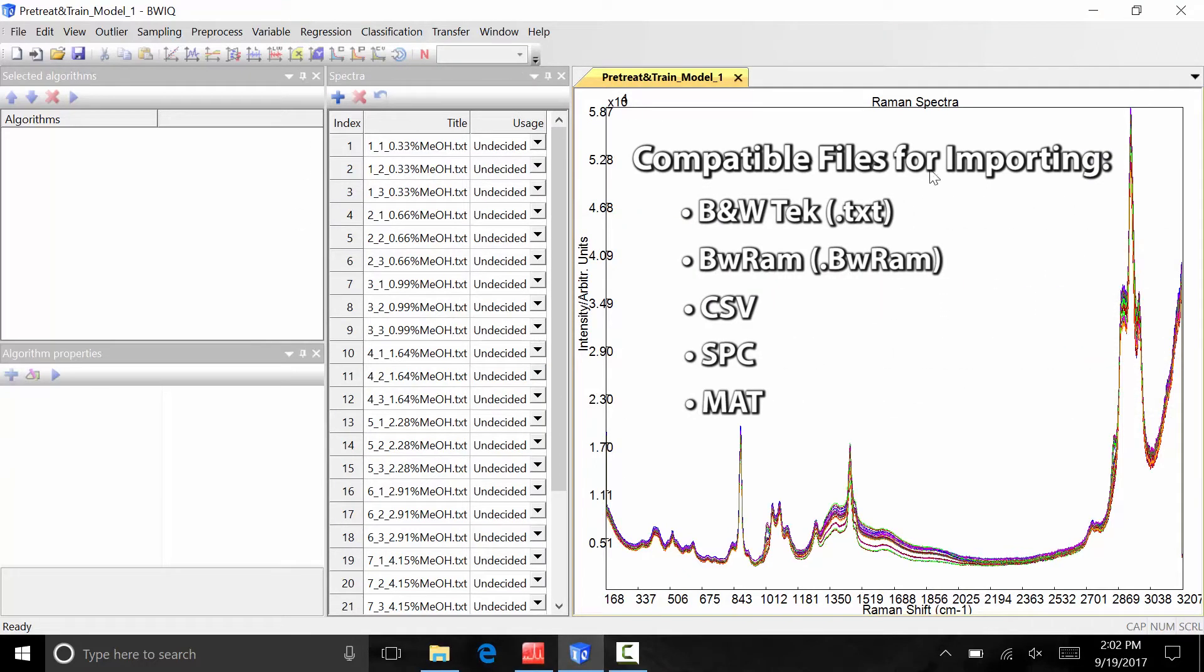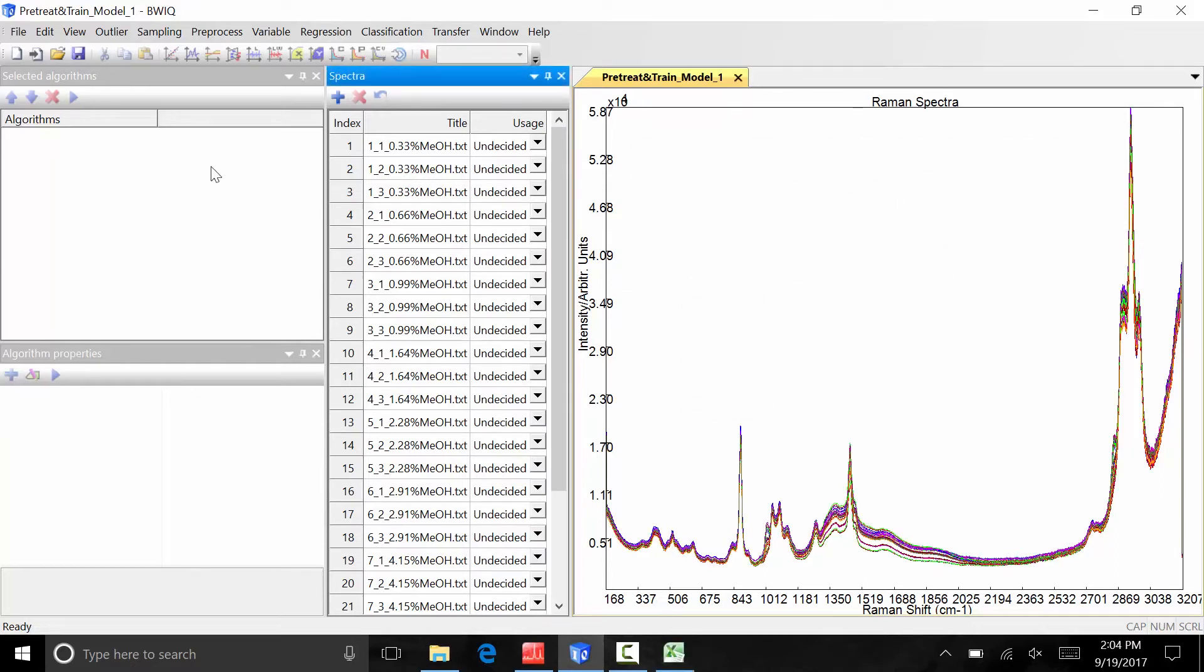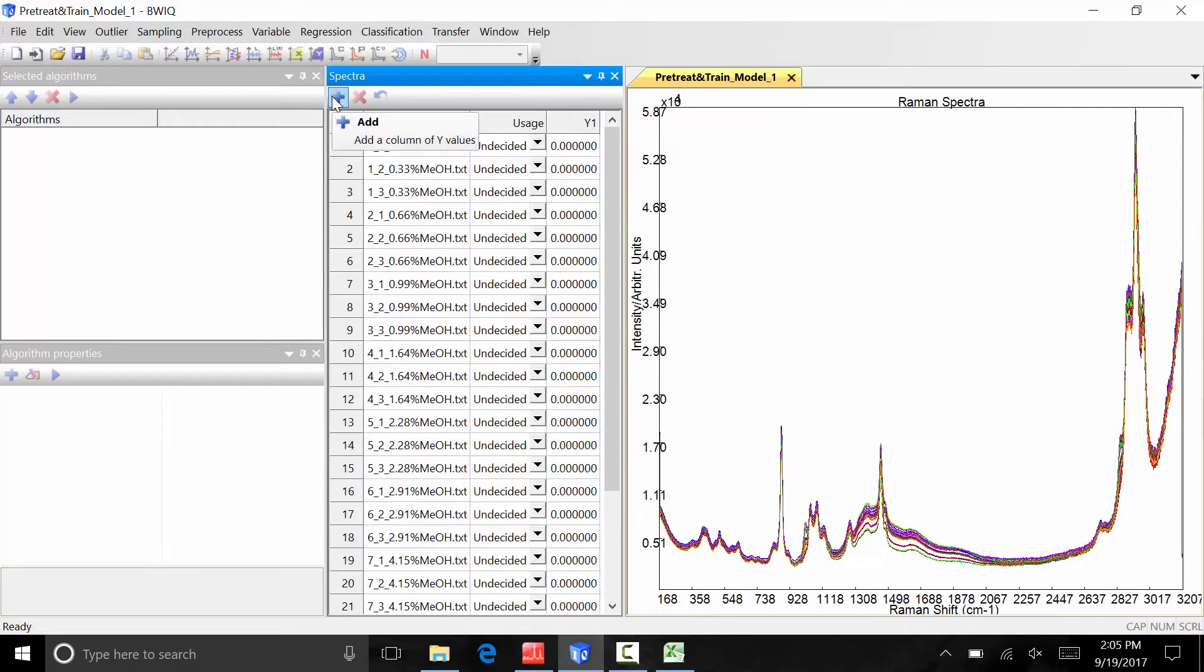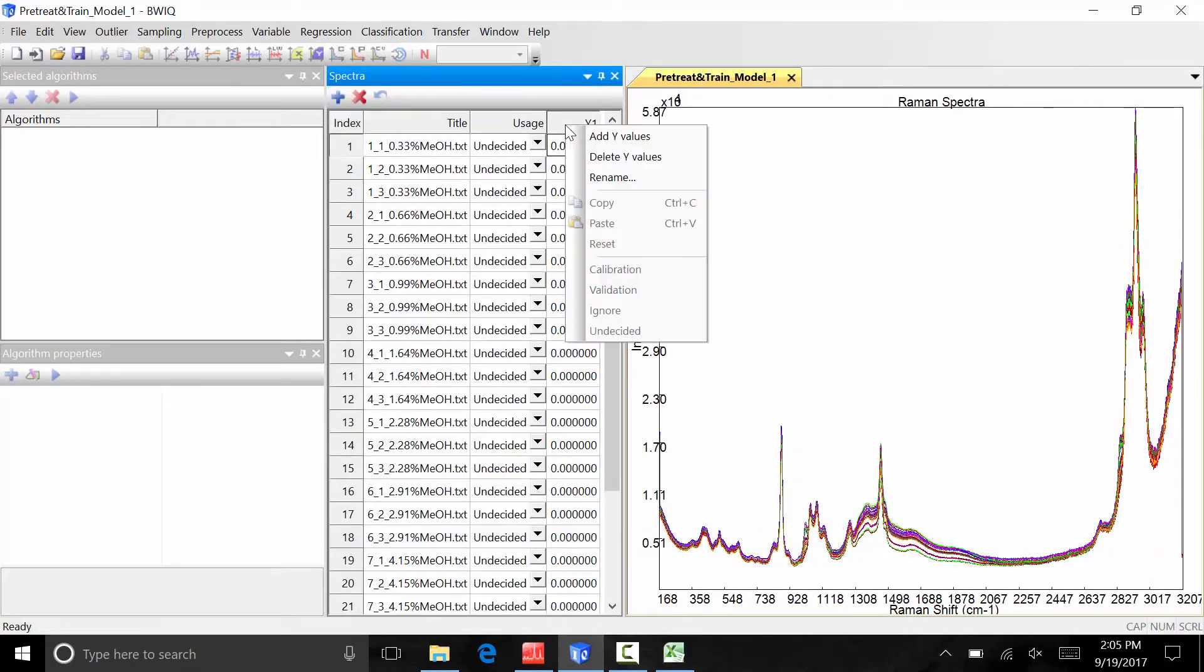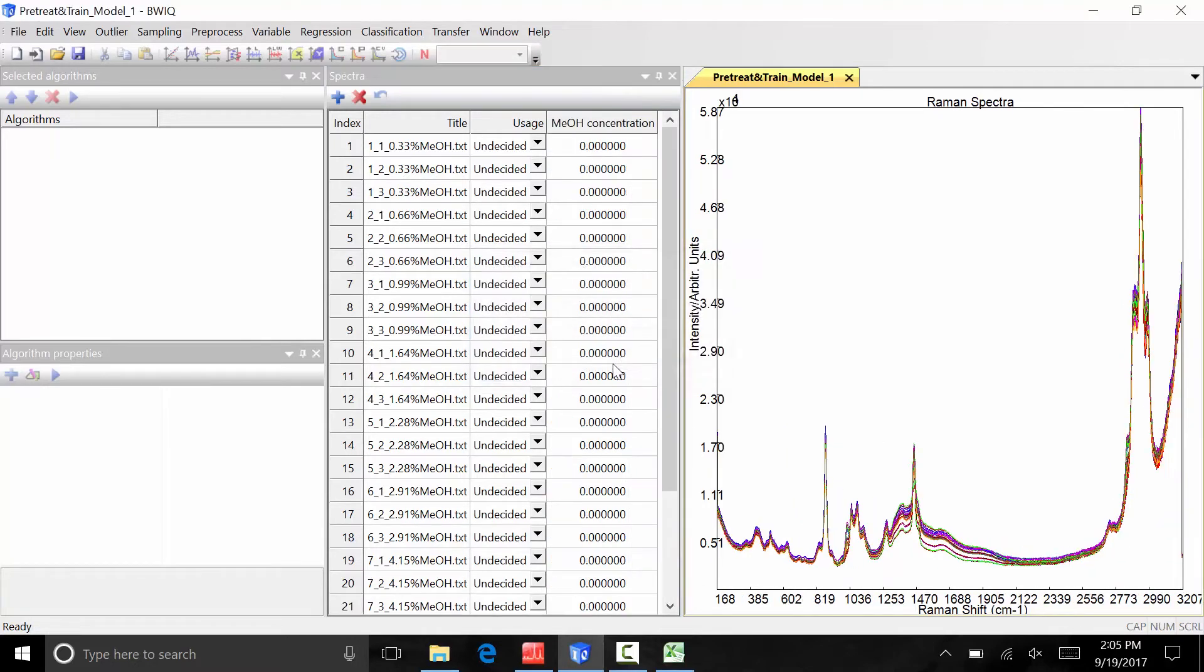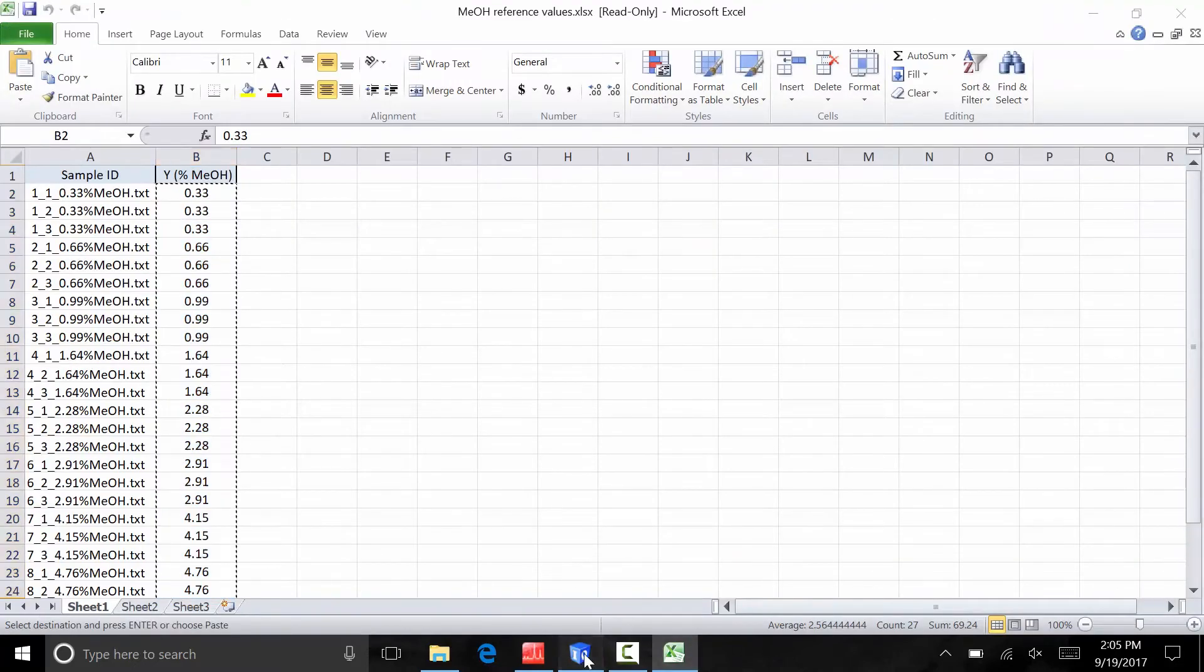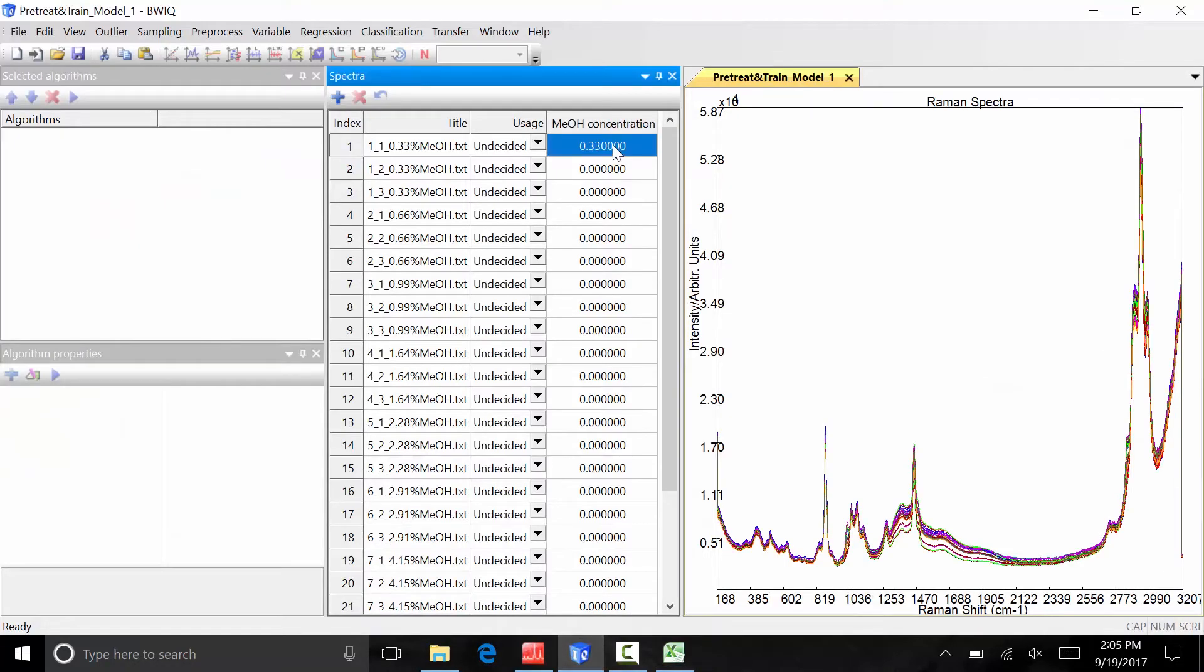Now that the spectra are imported into BWIQ, we need to add a variable to associate with each spectrum, in this case the concentration of methanol for each sample. To add a variable, click the blue addition button in the upper left corner of the spectra window. A third column will appear. The name of the variable can be entered by right-clicking the header cell Y1, selecting Rename from the drop-down menu, and inputting a name. This is where we will input the values for methanol concentration associated with each spectrum. You can manually input the values by typing them from the keyboard, or you can copy and paste from a list of values in an Excel spreadsheet.